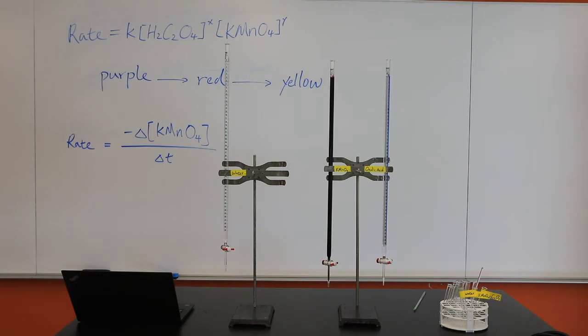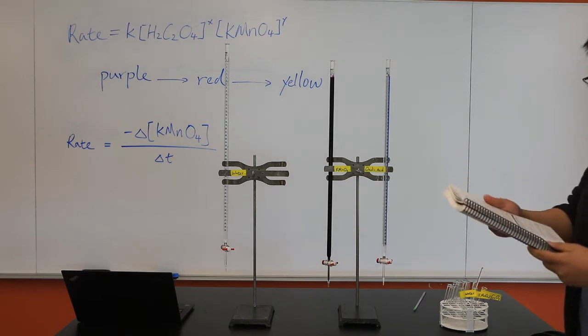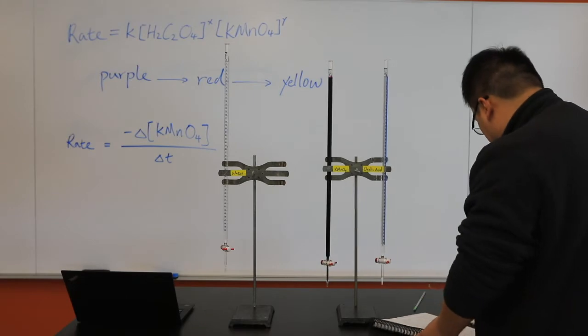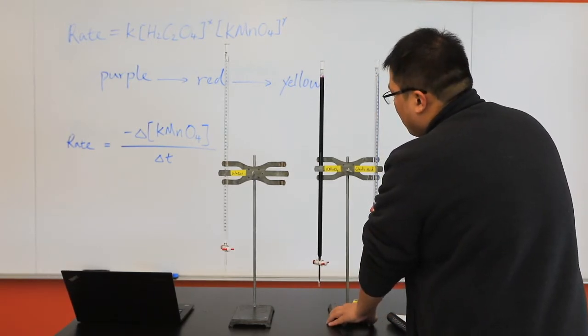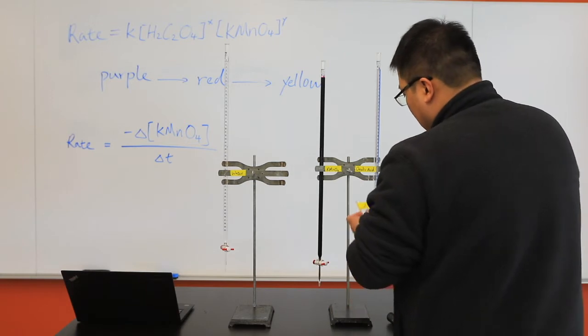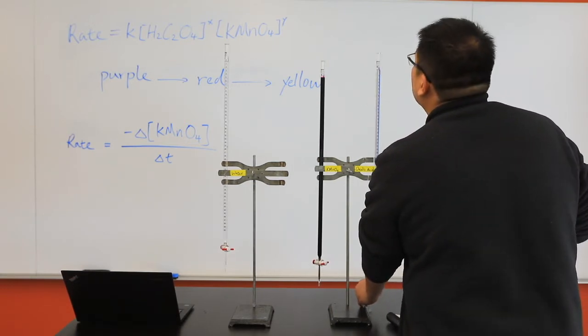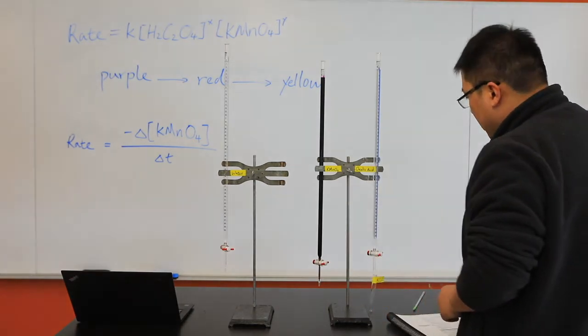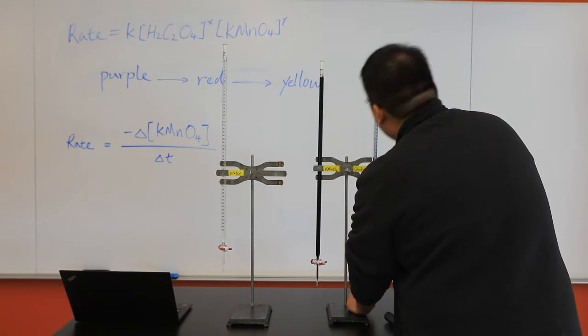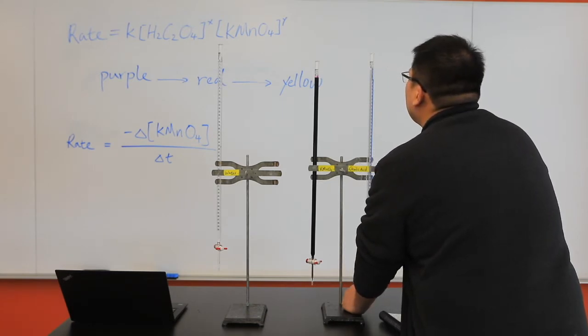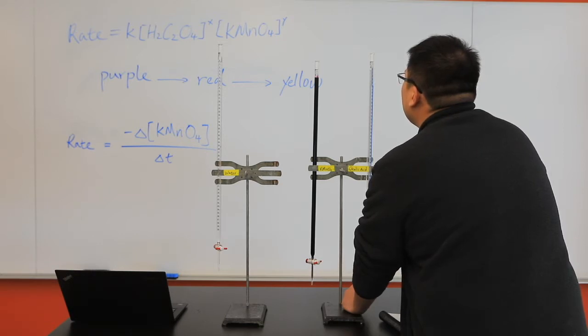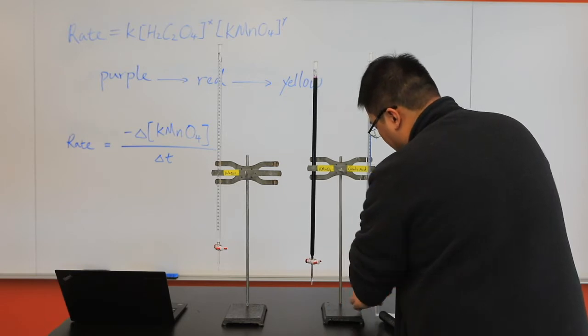By looking at the procedure, in your first determination, we're asking to get 5 ml of oxalic acid into a test tube. I have the test tube right here, and then I'm first going to get the oxalic acid. The reason we're using burette is to measure the volume precisely. Currently the burette is standing at zero mark, so we're going to obtain about 5 ml of oxalic acid. That's 5 ml of oxalic acid.